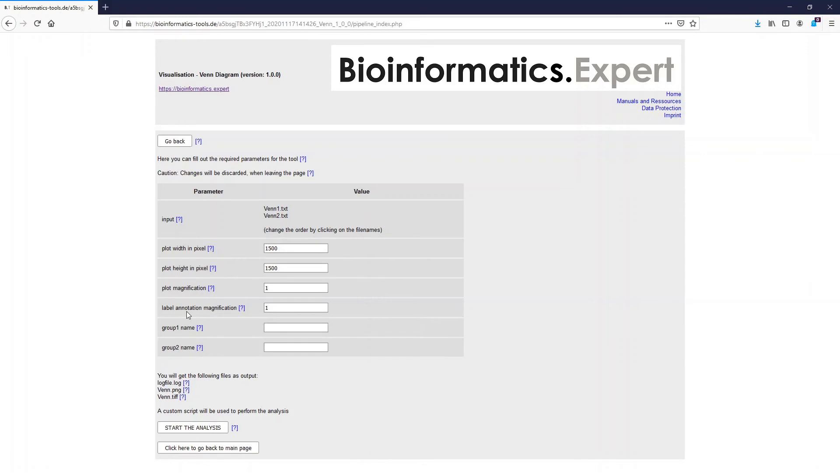Finally you can enter the names of the groups here and here so that they will be visualized in the output plots as well. I will just put in here Venn 1 and Venn 2 to represent the file names of the lists.